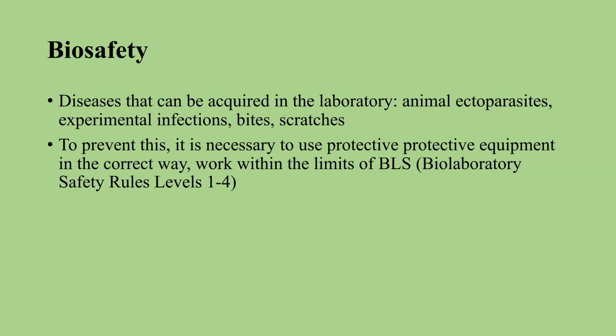Biosafety is very important, because if we use animals, they often have ectoparasites, some infections, mites, etc. You should be aware that these rats or mice pose a potential danger. According to laboratory safety rules, we distinguish four levels of safety.